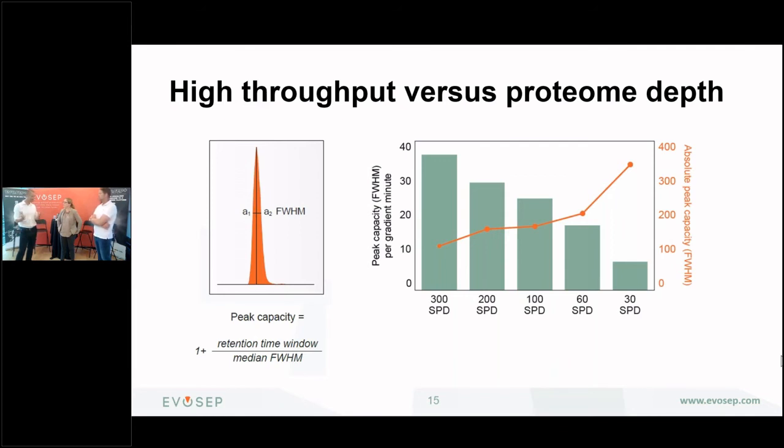So I don't know where this is going to end. I think the mass specs. It's clear enough though that as you approach clinical use, it's not just going to be about looking at one mouse that you perturb in some manner. It's going to be population genetics that comes into play and people's everyday lives, and making experiments with less than 10,000 people doesn't necessarily make sense. So you are going to see a lot more of these experiments where you will have tens, if not hundreds of thousands of samples that need to be compared somehow.